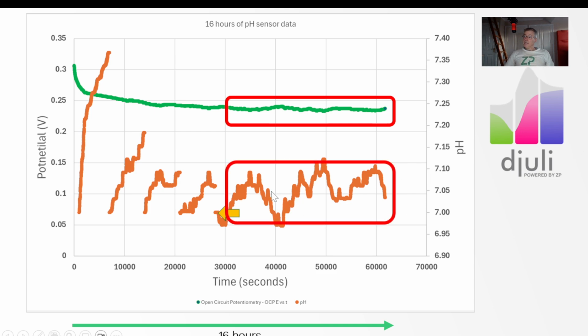we don't bother calibrating again, and you can see that at this point the sensor is fairly linear, staying fairly constant. The pH changes we're looking at, where we've really zoomed in here, are about 6.97 to just about 7.11. So at that point we didn't bother to calibrate again.